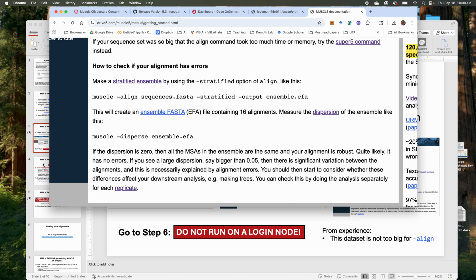I did that right. Well, I didn't. Well, let's test it. The file name, you have to actually put the file name in here, but I accidentally forgot to change it. Oh, you need a space after that. So your commands are right. Yeah, the only thing is, double check for you. I just don't remember. So the only thing is you might have to use dot slash. Yeah, and that's your actual command.